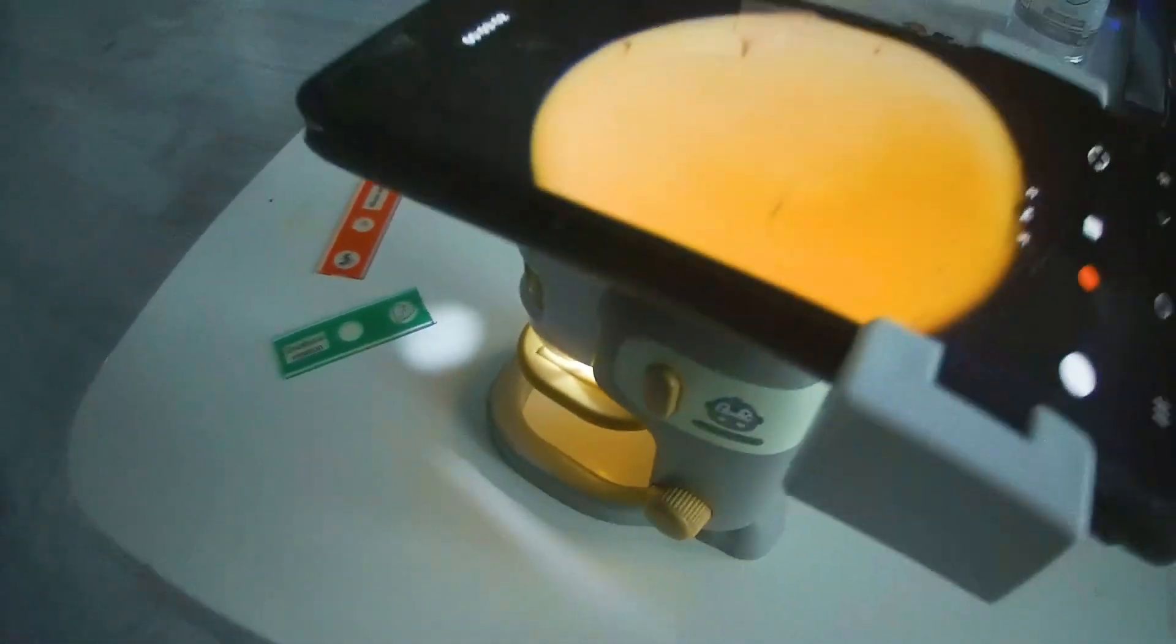Let's try something else. We're going to do corn whiskers, for example. And you can see there's a little bit of corn there. So again, we just slide it under. And let's take a look. Now, of course, you can move this slide around, which is kind of cool as well. So you can move this around as you're watching it.